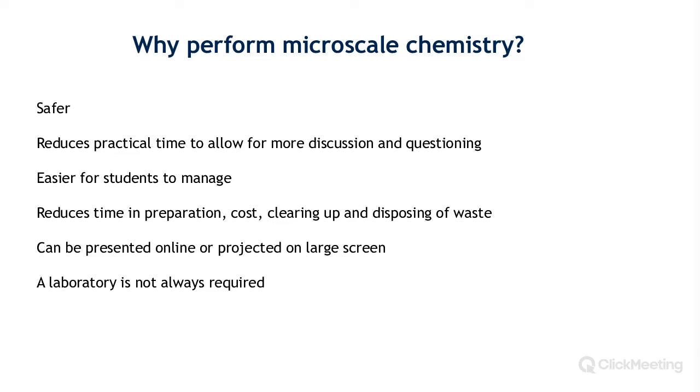With a few dropper bottles and a laminated sheet with instructions on the sheet to help focus it, and this is one advantage of microscale chemistry, the instructions can be in the sheet and they don't have to grab another sheet or look at instructions on a projector screen to do the experiment. So time can be probably used more efficiently with microscale chemistry for certain practicals, leaving more time for observations and questions.